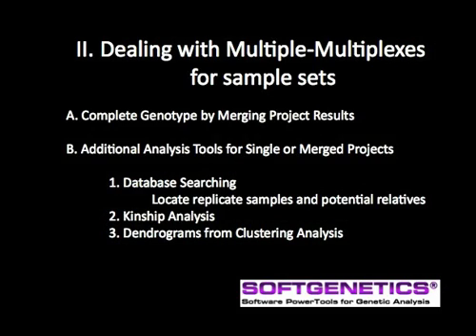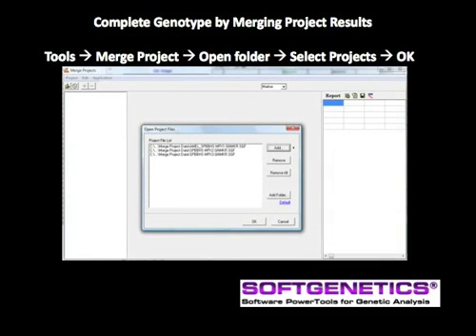The Merge tool is a process for combining the results of completed projects. To maintain result integrity, edits are not enabled in this tool as it would be in conflict with the previously approved and saved projects. Access the Merge Project tool from the main menu using Tools, Merge Project, open the folder and select the projects, then click OK.